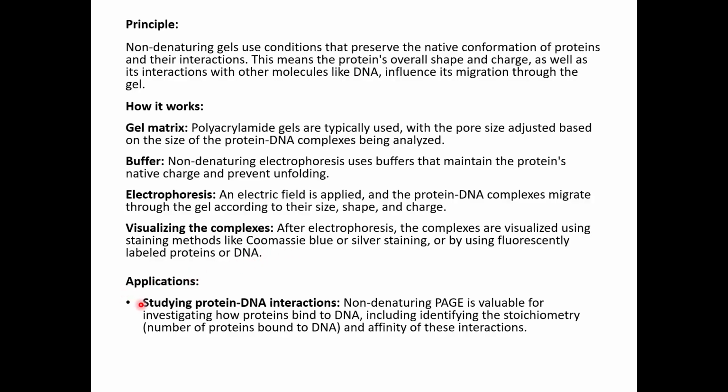Then coming to its applications, we have protein-DNA interaction studies. So non-denaturing PAGE is valuable for investigating how proteins bind to DNA, including identifying the stoichiometry, that is, the number of proteins bound to the DNA, and the affinity of these interactions. So the more proteins that are bound, the more the interaction, and the more the shift, etc.